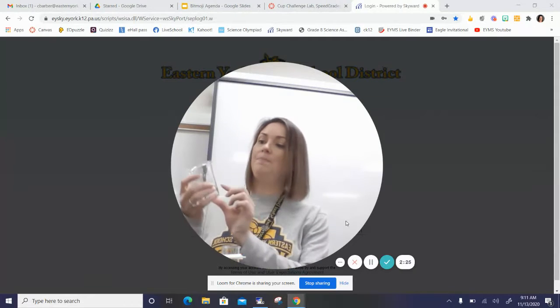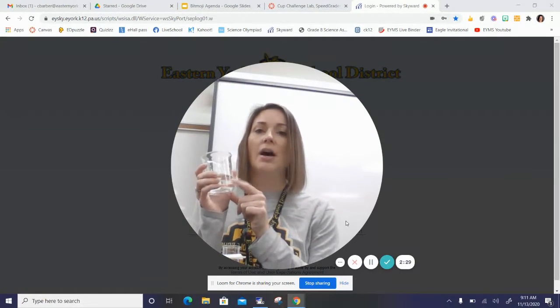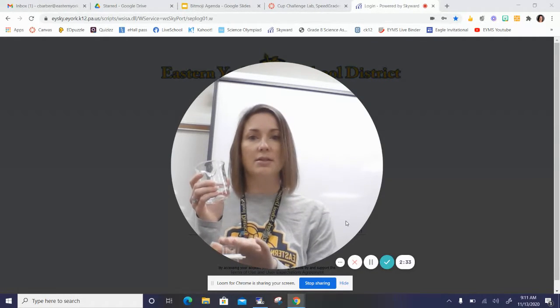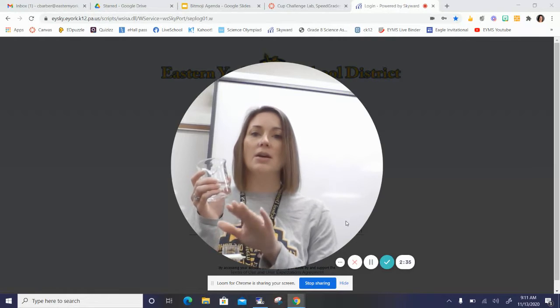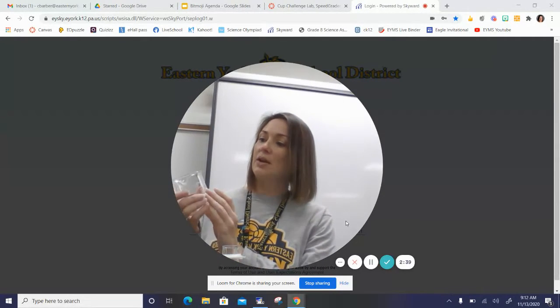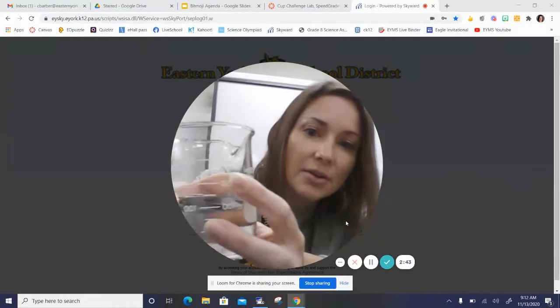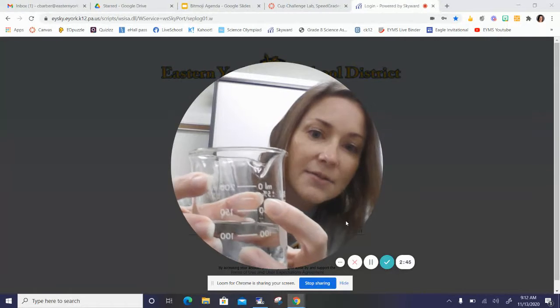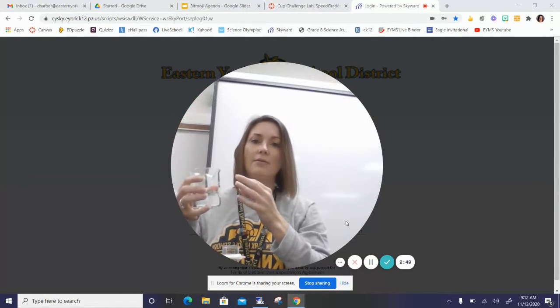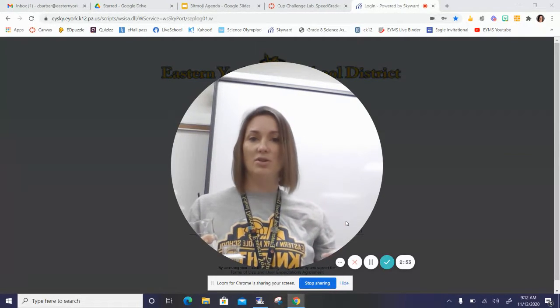With the beaker, because you have to estimate because there's not a bunch of lines here, you are not going to get as accurate of a measurement. So the graduated cylinder is more accurate because of all the tiny subgraduates. The beaker is not as accurate, and here it's actually telling you, it literally says plus or minus 5%. It's actually indicating on the device itself that it is going to be up to 5% off with the measurement.